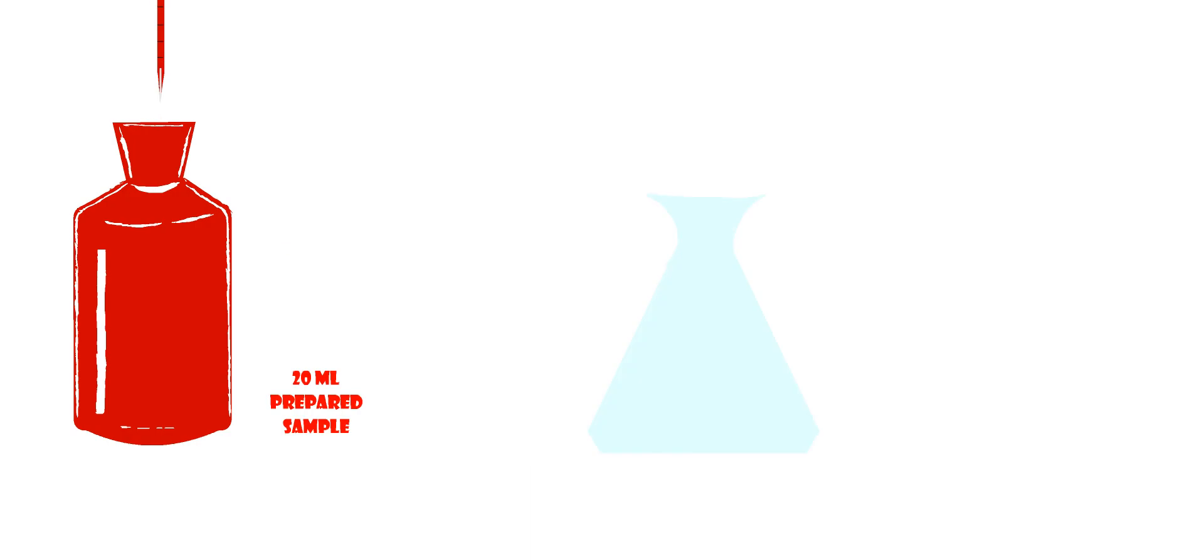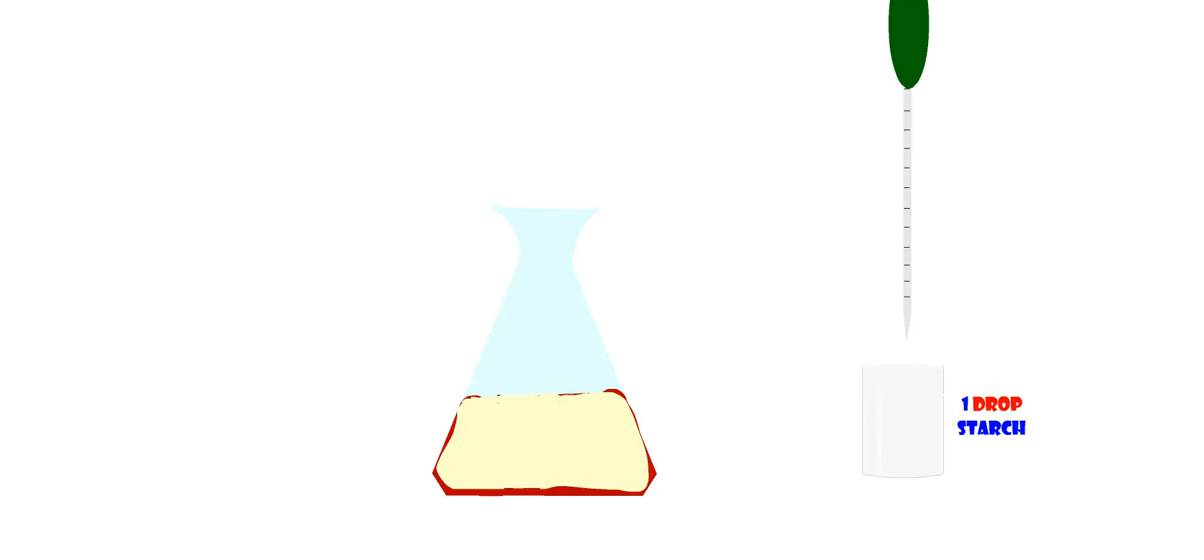Step 7: Take a clean flask and pour 20 milliliters of prepared water sample. Titrate it against 0.025 normal sodium thiosulfate solution from a burette until pale yellow color develops.